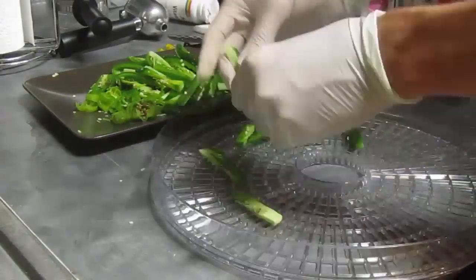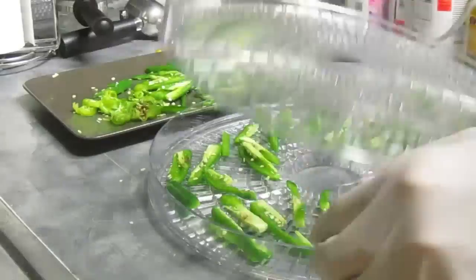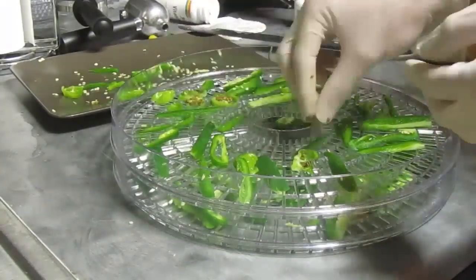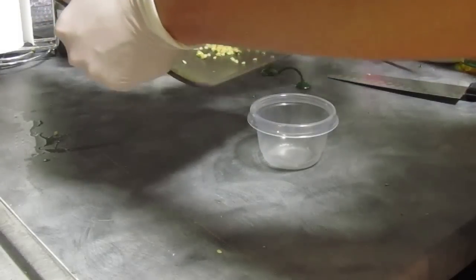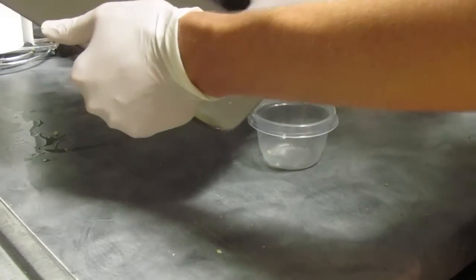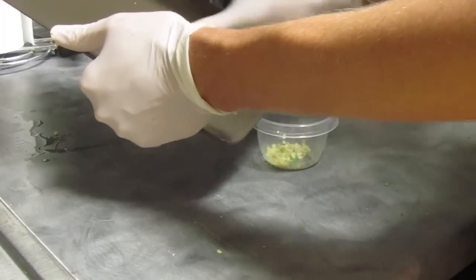What I'm trying to do is chop them up to get the most surface area so they dry out and dehydrate fastest. Throw them in there. And definitely want to save those seeds — those are important. They contain the most capsaicin.